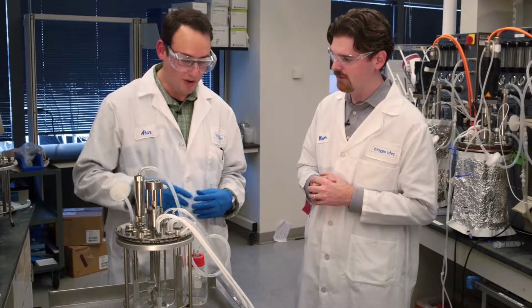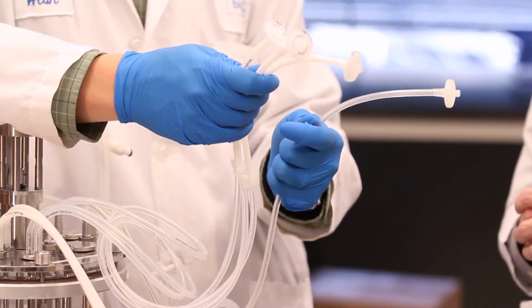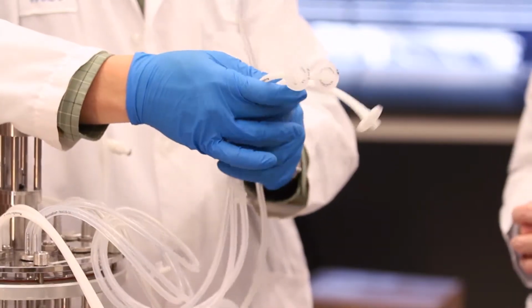Correct. So we have the filters on the end of everything. Each one's a 0.2 micron filter, with the idea that you're going to be able to keep bacteria and fungus outside of the reactor while keeping all of your cell culture protected inside the bioreactor.